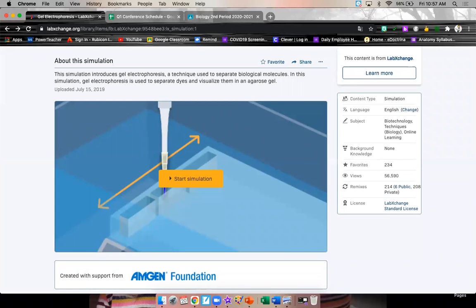Ladies and gentlemen, today we are going to be doing a lab called gel electrophoresis. This is one of the ways scientists like to test your DNA, compare DNA samples, where we can actually hold your DNA up to another DNA sample and see if the same one, or see if you're related to someone else. So let's see how this works.